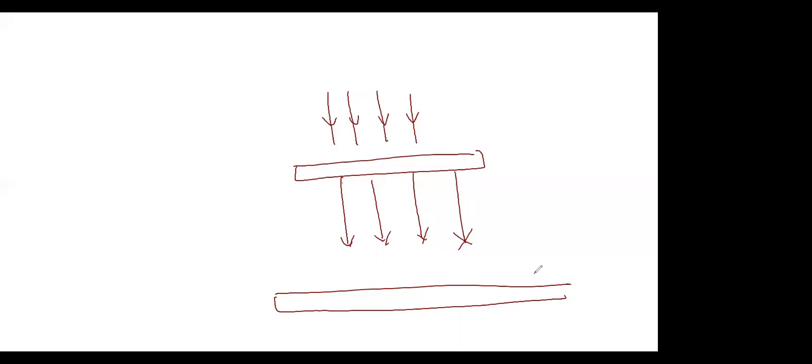And you can also have electrons which are diffracting at an angle. Okay, you can have diffraction. You can have diffraction also at the other side, because it will be a cone actually.